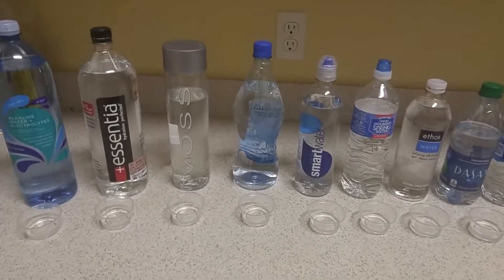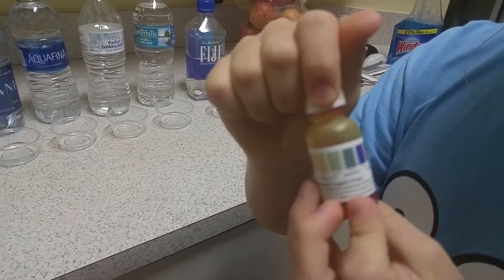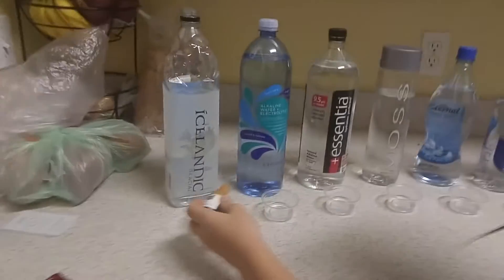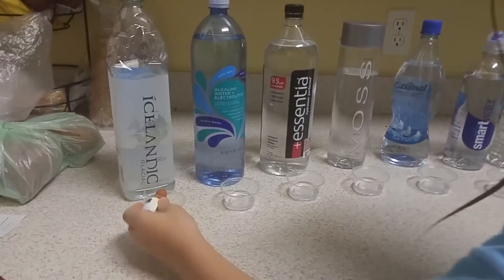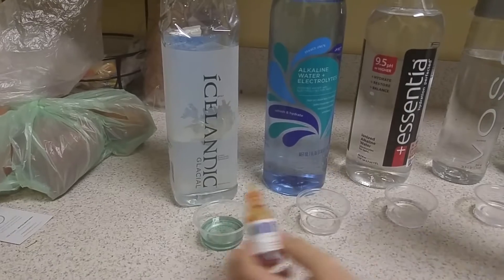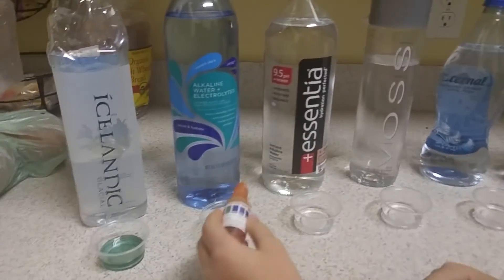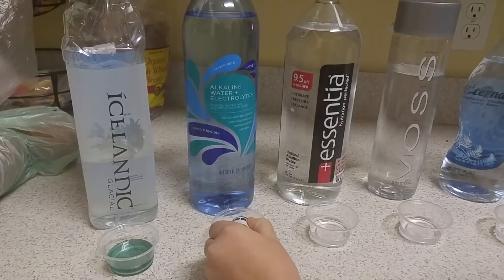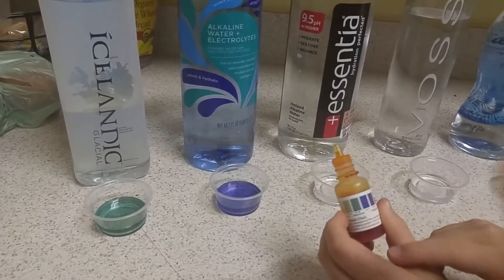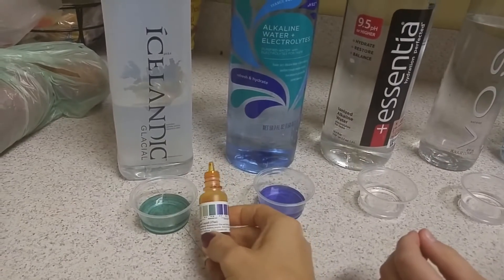My assistants are getting the drops going. The bottle shows the different colors we're going to match up at the end. We're starting with Icelandic Glacial, which advertises a pH of 8.4. After putting three drops in and letting it sit, comparing it to the chart — that matches the green right there. So Icelandic claims to be over an 8 but right now it's measuring 7.